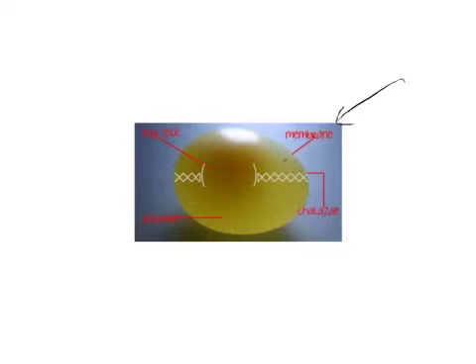and that membrane is obviously all around the outside of the egg. You still have the other parts of the inside of the egg, the yolk, and I'm not even going to try to pronounce this word, but I'll give it a shot, the chalazae. In any case, these internal anatomy parts of the egg are irrelevant for our experiment, because what is important is that you have a membrane that's semi-permeable.